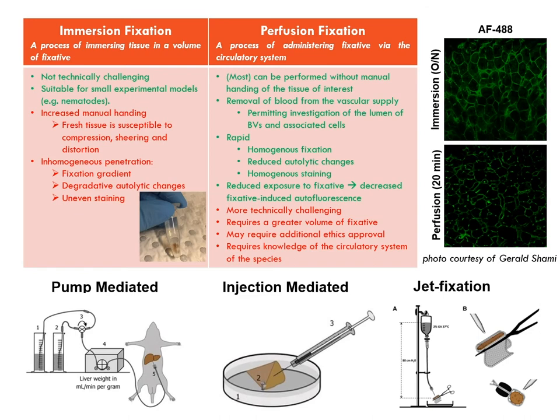Perfusion fixation is a process of administering fixative via the circulatory system, and it can be performed via pump-mediated, injection-mediated, or jet fixation. You can see the example on the right comparing immersion and perfusion, and perfusion had more homogeneous fixation and homogeneous staining in the end.